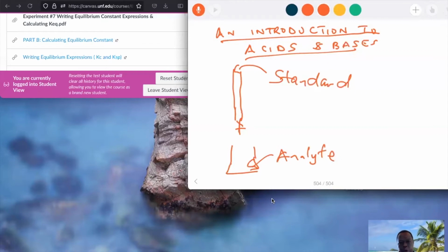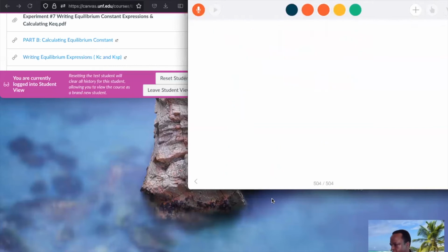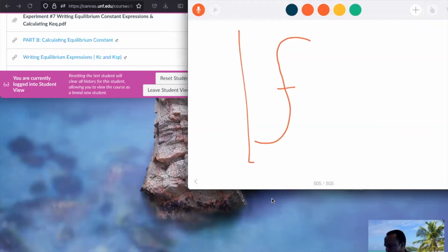Now, there are 4 curves. There is a strong acid, strong base curve, which you should have looked at. I know you know that, where there is a point of inflection, or the point where there is a steep curve. You have pH on the y-axis, and here is the volume of titrant.